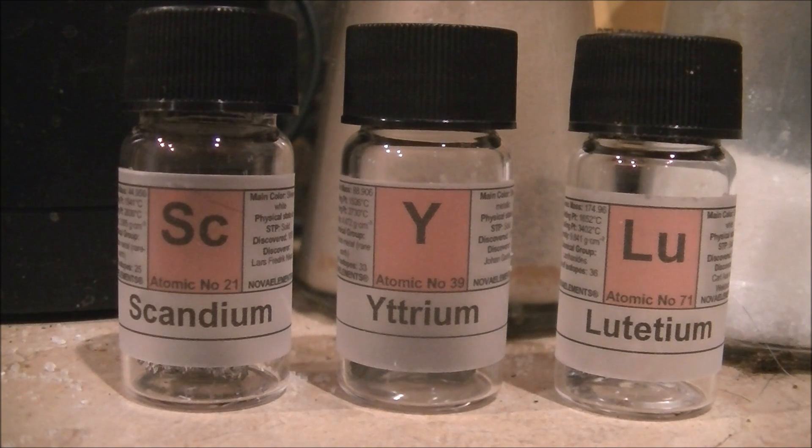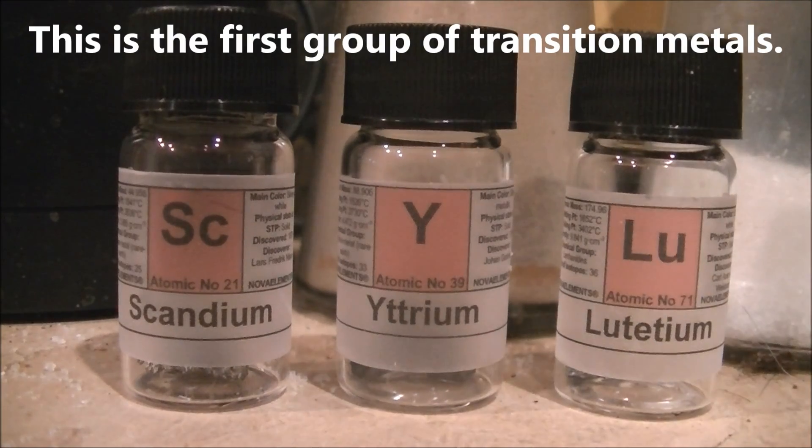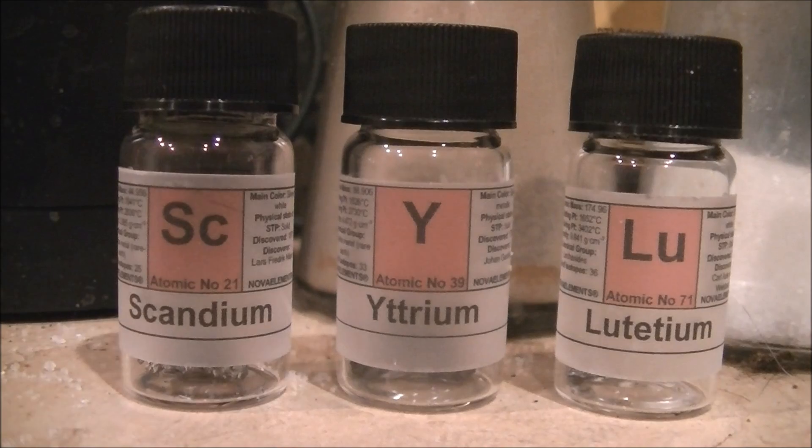There are four elements of the third group of the periodic table: scandium, yttrium, lutetium, and lawrencium. For obvious reasons, I was not able to obtain any lawrencium, but I'm going to drop all of these metals in the scandium family into water to show how they react.